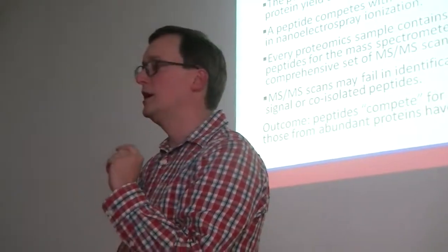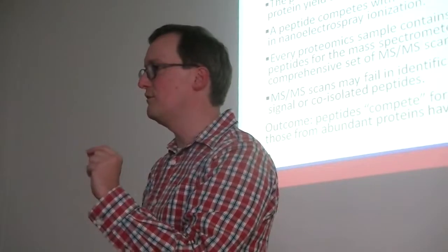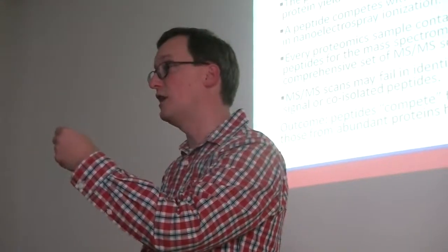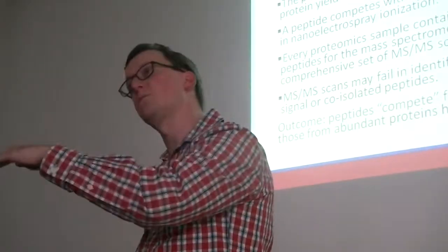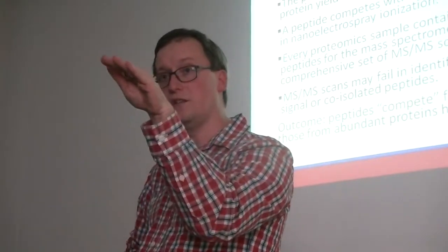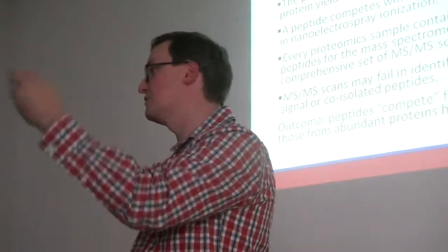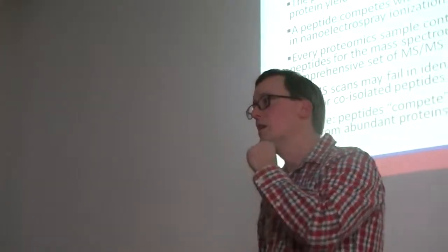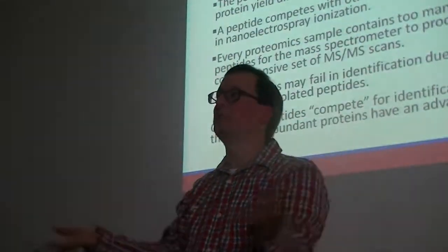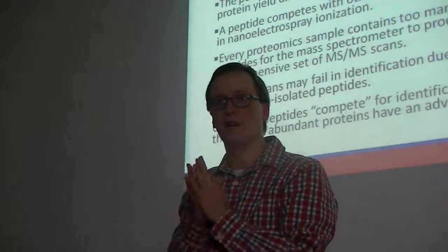However, it is possible to identify individual peptides in multiple forms. You may identify them in both a +2 charged form and a +3 charged form. You may identify them in an unmodified state, or in a state where a methionine has been oxidized, for example, or carries some other modification. So this means that there's something of a cloud of possible peptides that might be observed for any protein.